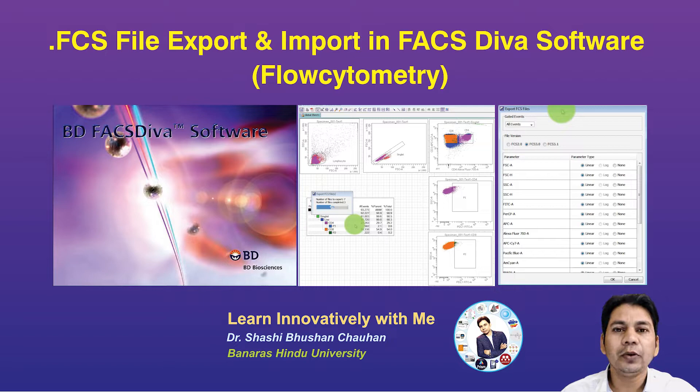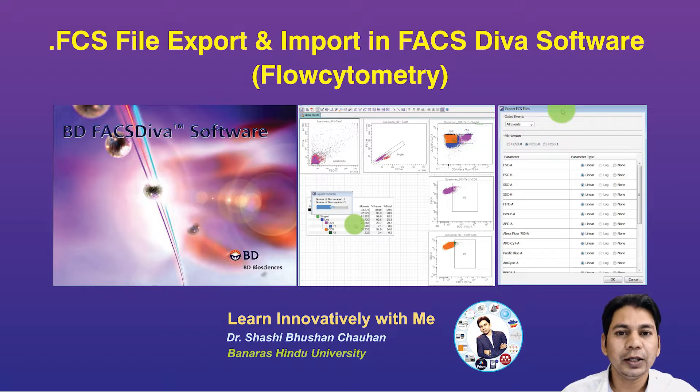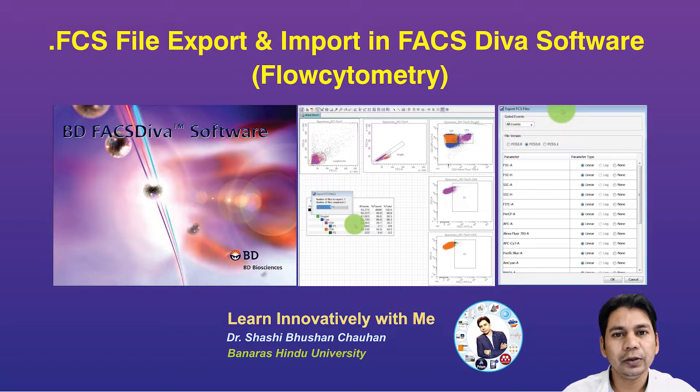it is very important to know how you can export FCS files and also how you can import the FCS file in the FACS DIVA software. So I am going to show you how you can do this.